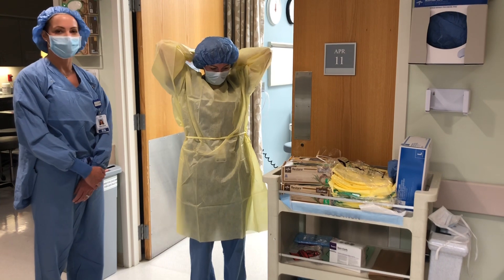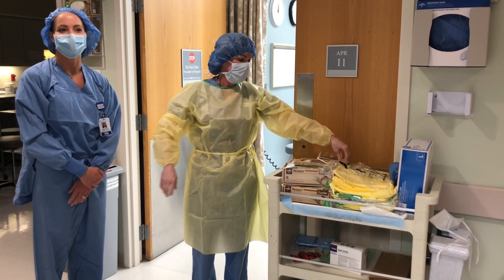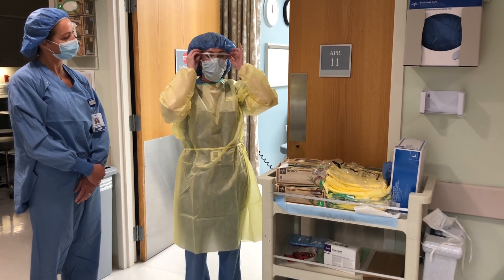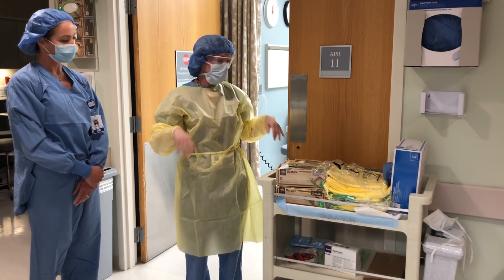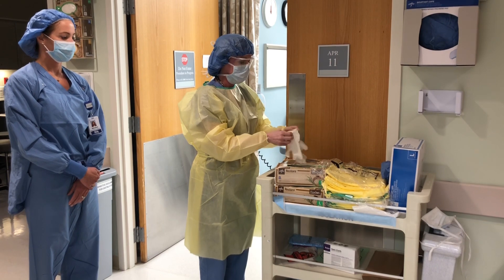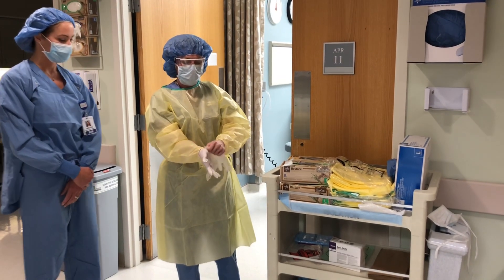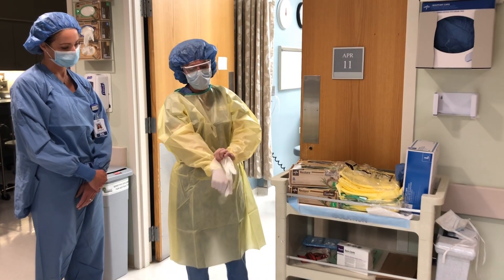I think a lot of the staff upstairs they know how to don and doff, but this has been a good refresher for them. Next I'll put on my eye protection and just make sure that I'm secure around my nose so I don't fog up. And then I'm going to put my gloves on and make sure that I seal so that no skin is showing.